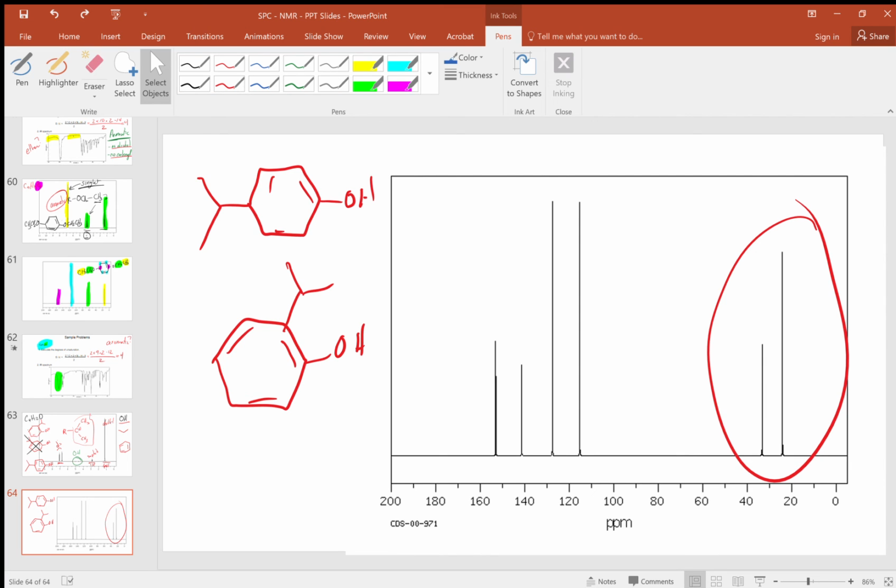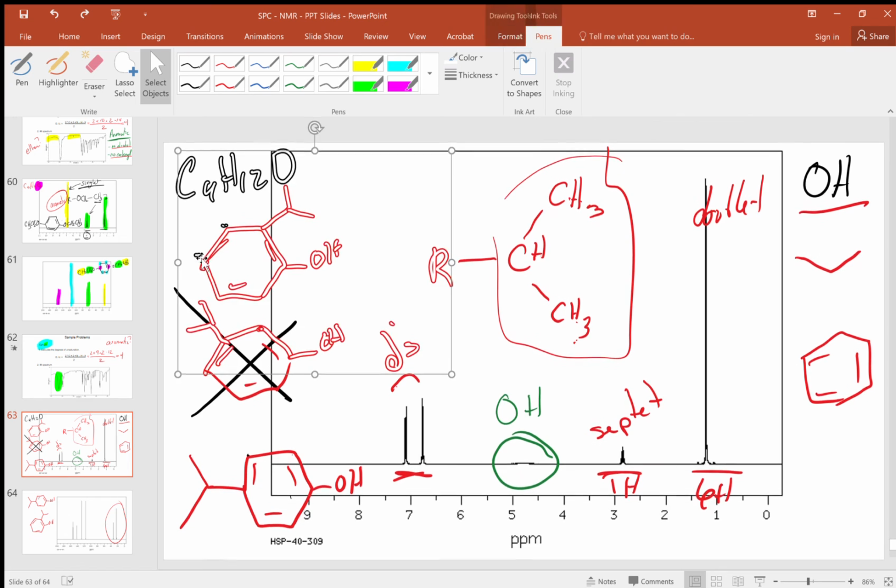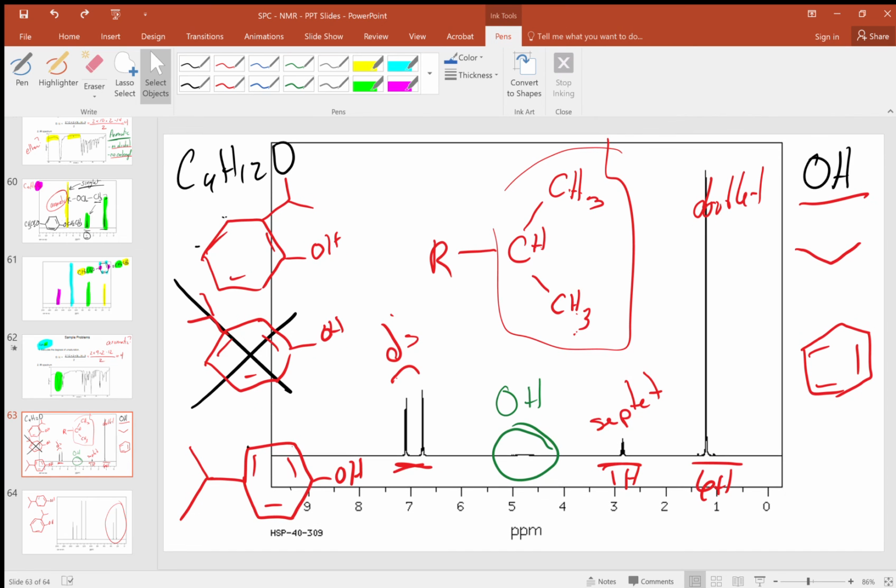and we're going to go back because I've made a mistake here. These 2 are not both doublets, and I'd like to correct that. Here we'd have a doublet. This one is adjacent to 2 that are not equivalent. Doublet of doublets, same here, and this one is a doublet.